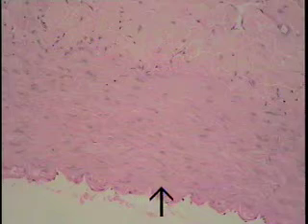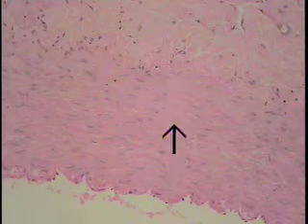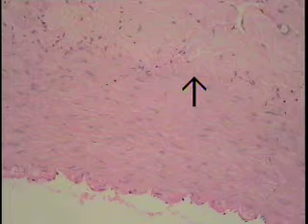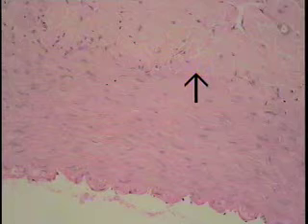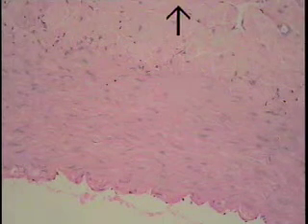Because it's an H&E preparation, it is very lightly stained, and one can then make out the smooth muscle wall of the tunica media. Then if you look carefully along here, here is the external elastic lamina, frayed once again into 2 or 3 laminae, separating the tunica media shown here from the collagenous connective tissue of the tunica adventitia shown at the top of the field of view.